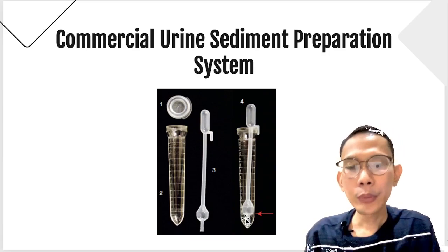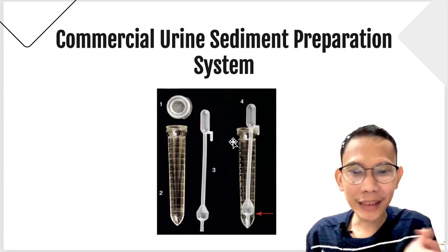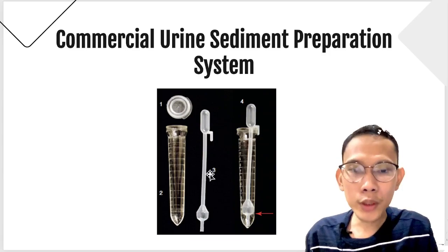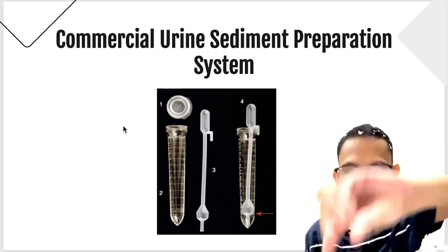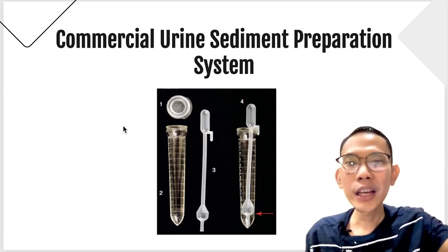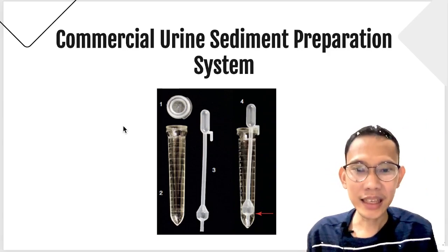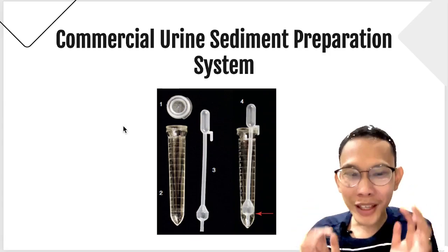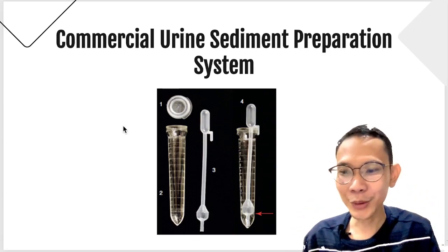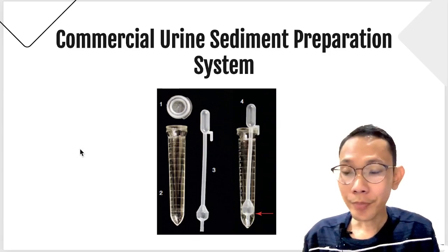Again, we do not use this one. I never tried. Hindi pa ako nakakita ng ganitong system. What we usually do in the hospital lang, test tube, tinatapon lang natin. Yung natitira, imimix lang natin, i-resuspend thoroughly. Yan yung ilalagay sa ating glass slide. You can really do this when we have our limited face-to-face. Sige lang, tuturuan namin kayo, okay?